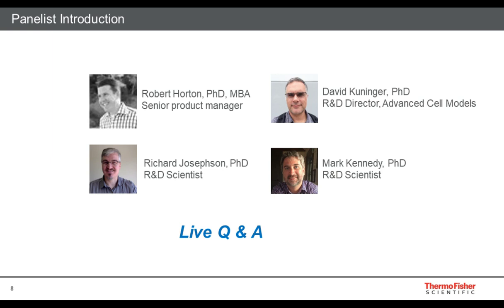Well, obviously in neuroscience, the gold standard is activity. So we do record from neurospheres, our neural spheroids, on a microelectrode array plate. And it can be very, very difficult to get good results with that. Even plating spheroids down, we're finding, is a tricky process. So there aren't that many people who have successfully recorded from spheroids. You can't really stick a patch clamp in them and record from them.